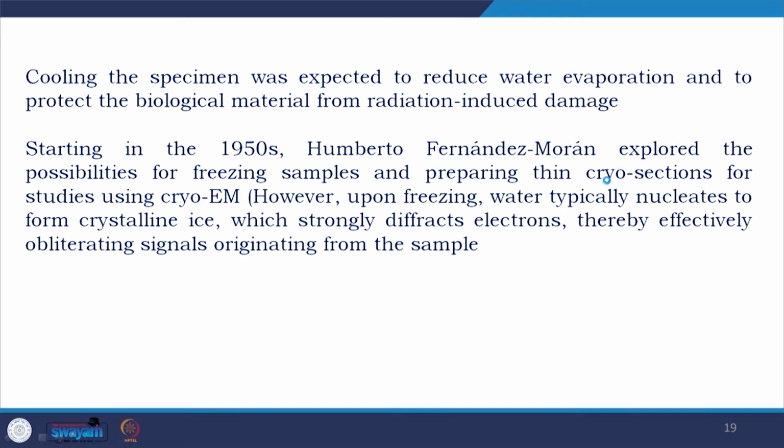So, what happened: you have the sample and now you do the freezing. Freezing gives you ice crystals which diffract very strongly at around 4 angstrom. So, you get the signal coming from the water more than the signal coming from the sample. That was the problem.